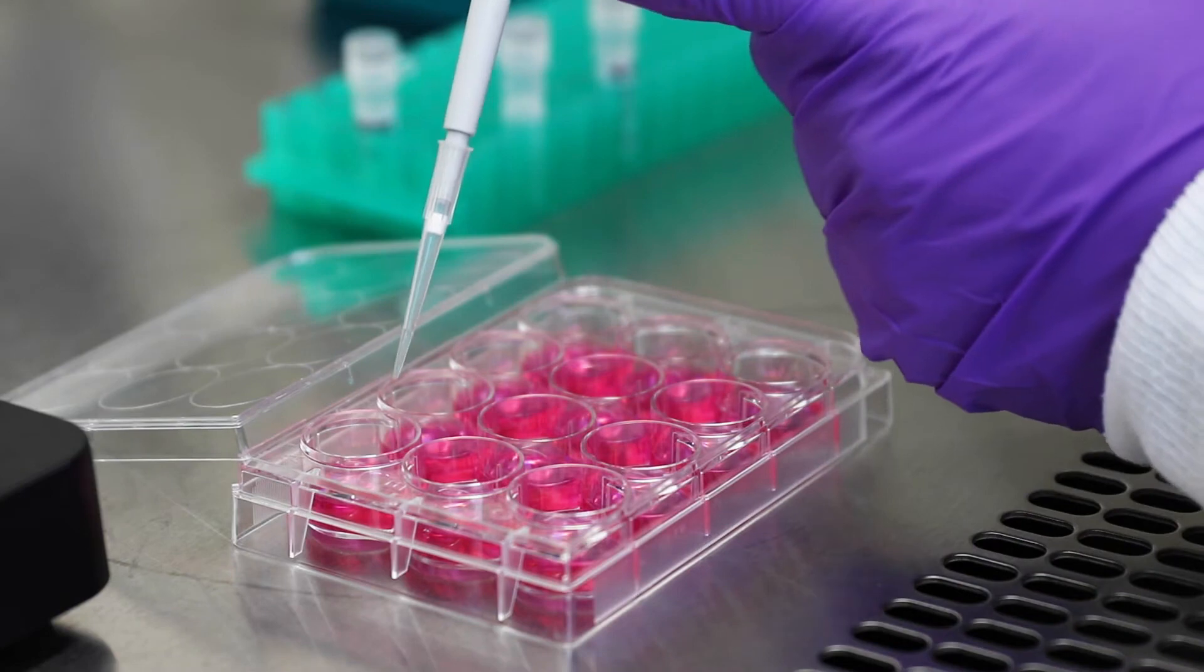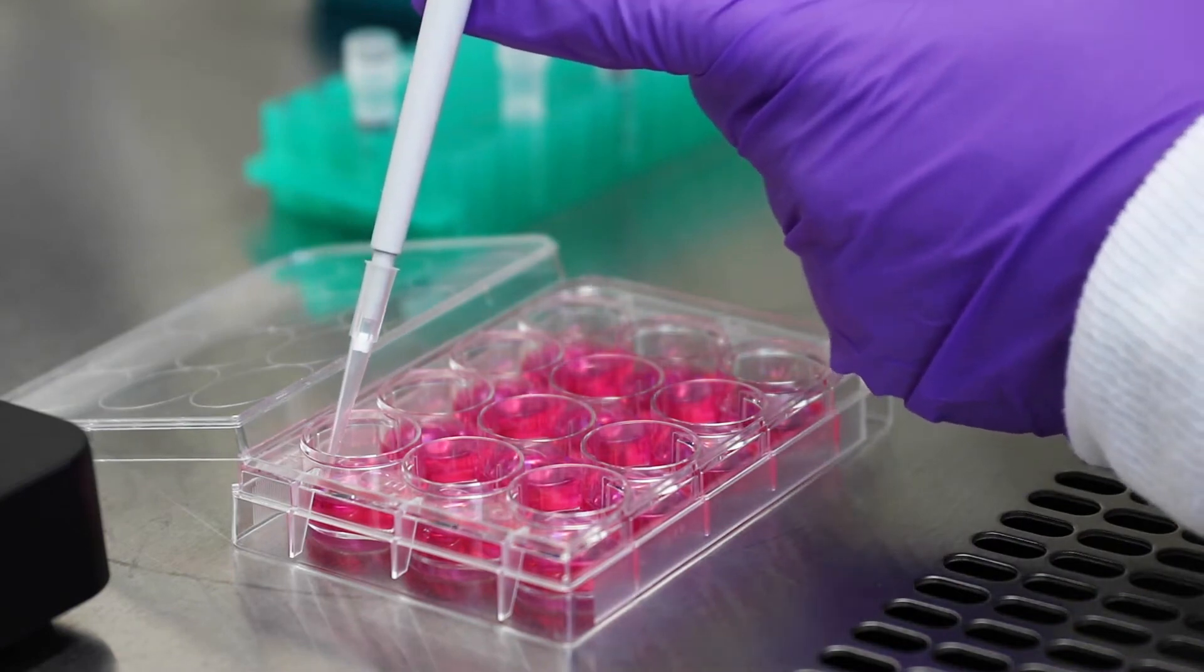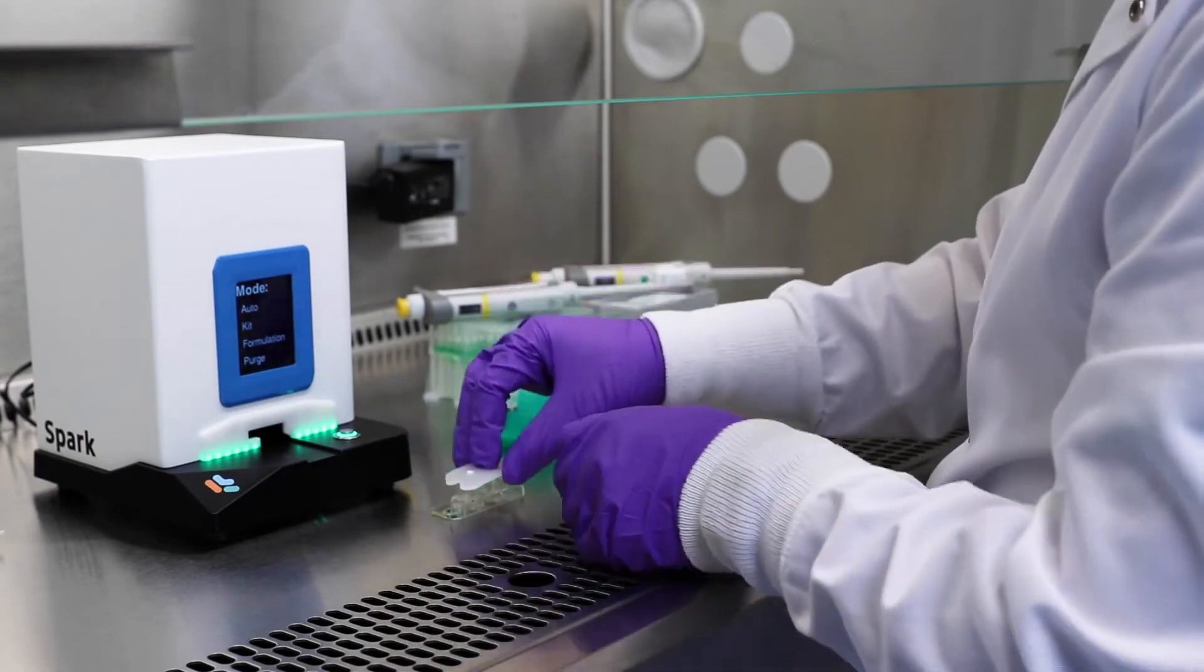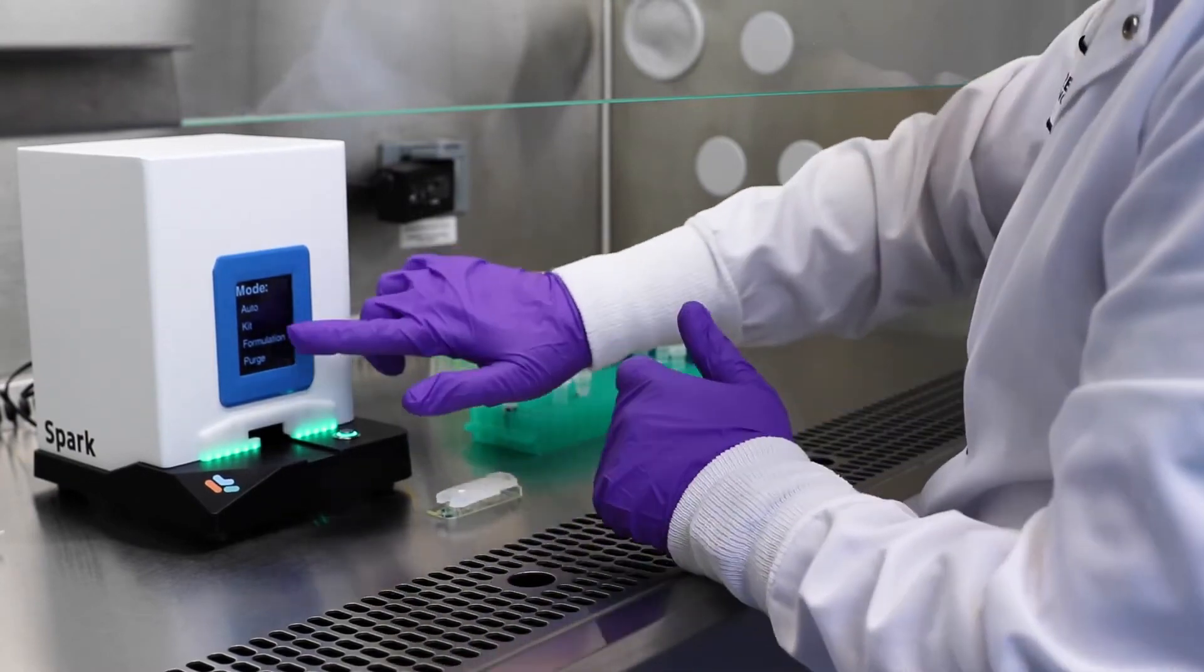The resulting LNPs can be diluted and applied immediately to cell culture. Additionally, the Spark is designed to be placed in a biosafety cabinet to integrate easily into a sterile cell culture workflow.